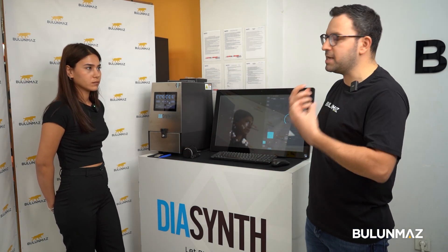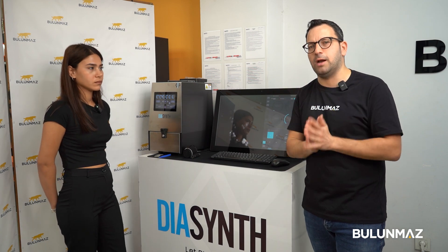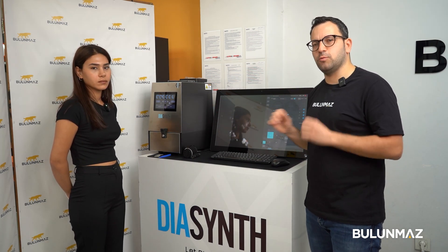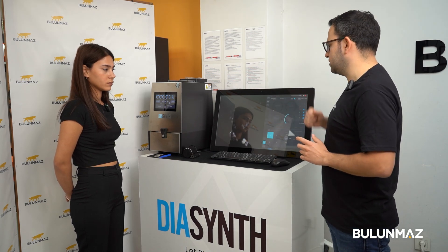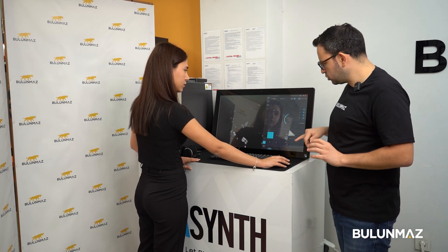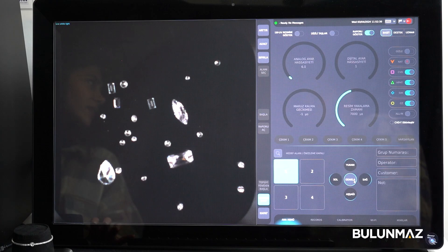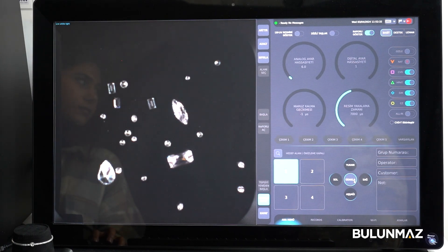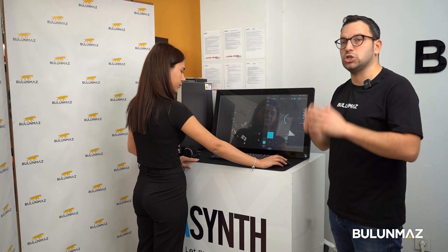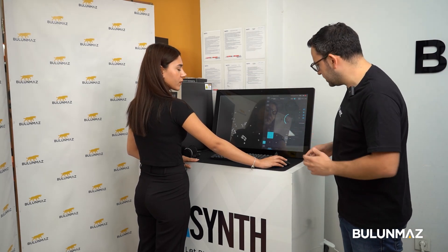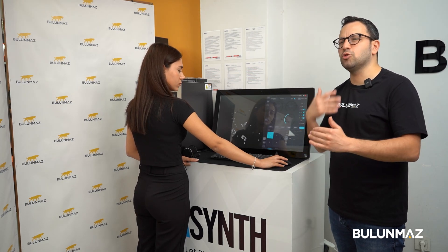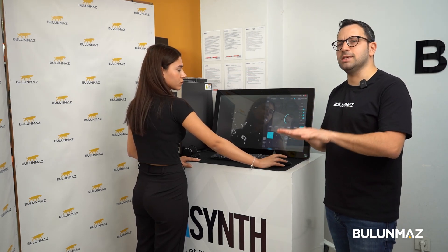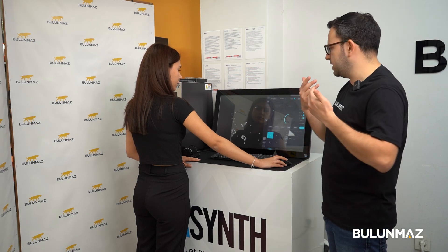The machine works with a very high definition camera, and this cover makes sure it is totally dark inside so the machine can make photos with perfect performance. After the tray is closed and we are sure there is no light inside, we start the operation. First you have to focus — there is a focus screen. We are using Turkish language here, but there are many different languages in the software: English, French, Chinese, whatever your language is. When we do the focus, we switch off the camera to reset, and then the machine is ready to work.